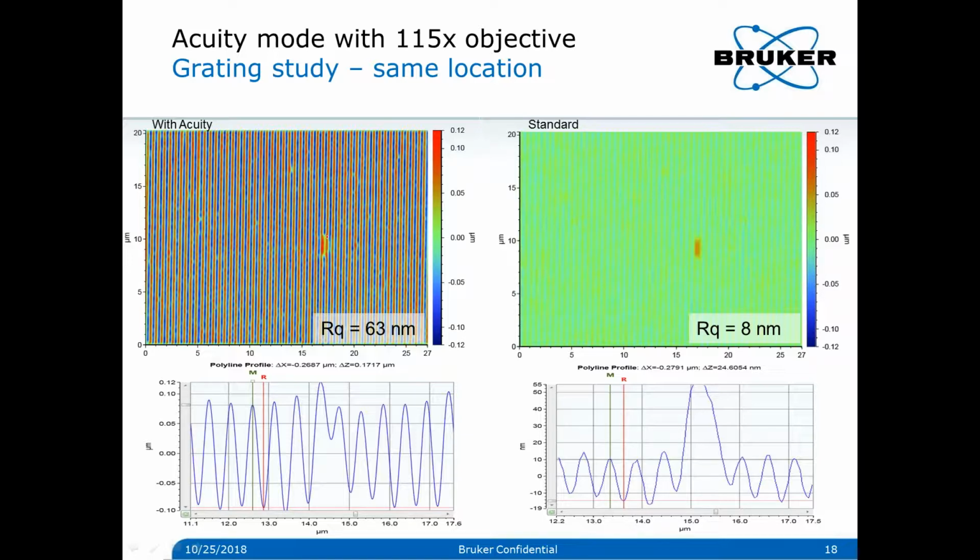You understand that this grating is a stamp, made of polymer and stamped. So on that image you understand that the wall of polymer resin, which was heated, has partially collapsed and got some kind of adhesive behavior by capillary forces, rather than thinking that this is a defect. So you really see the advantage of gaining lateral resolution: first of all, we can measure the grating correctly, the depth is right, the periodicity is right, but also we can have clarity on the exact reason for the defects.